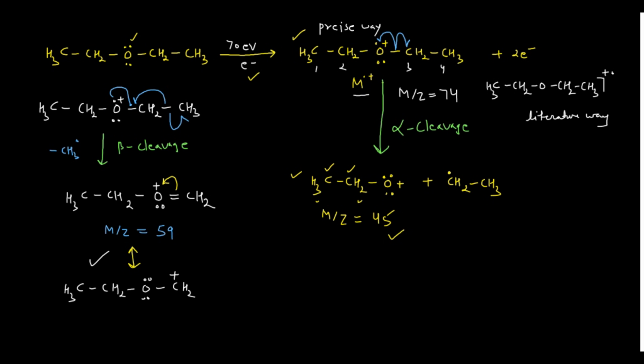Okay, and now the explanation of that thing. I am writing with the blue here, so how it is producing. You have already produced this particular ion, right? And from this particular ion you will get your peak at 31. So what I am doing, I am drawing this again.